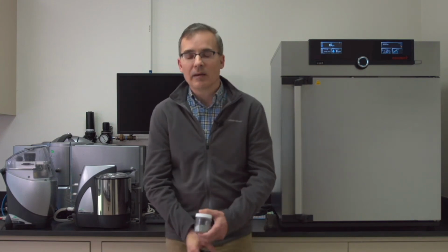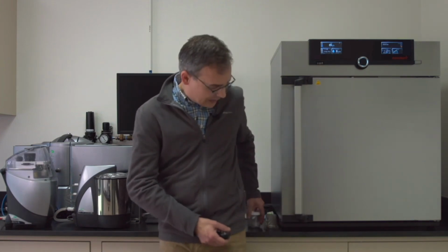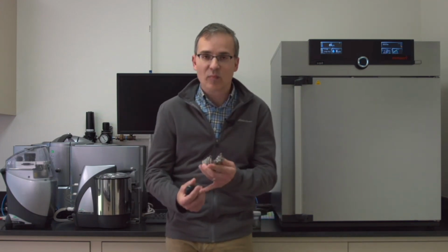And then beyond that, we look at the base material properties themselves. And this is primarily the bulk and trace chemistry of the metal alloys. We have a very wide range of analytical techniques, from spectroscopy methods to combustion, inert gas fusion techniques, as well as classical wet chemistry techniques to look at those chemistries in the metal powders. And then also we can look at the true density of the material using something called helium pycnometry, which is based on Archimedes' principle and basically just looks at the fundamental density of the metal itself rather than the particles or the powder.